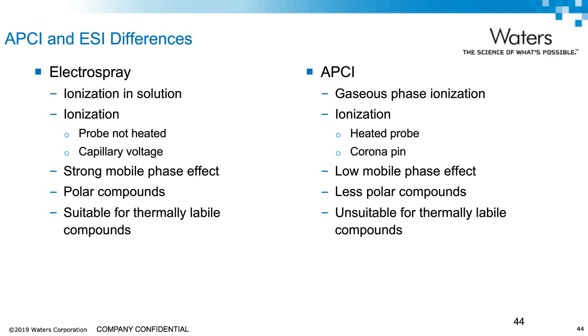In electrospray, ionization occurs in solution before nebulization, and in APCI, it occurs after nebulization. In APCI, the probe is heated, and in ESI, it is not. The more polar a compound is, the more likely it is to ionize in ESI. And the more thermally labile a compound is, the more likely ESI is a more suitable technique. All of these factors should be considered along with the factors discussed earlier in the webinar when choosing between these techniques.